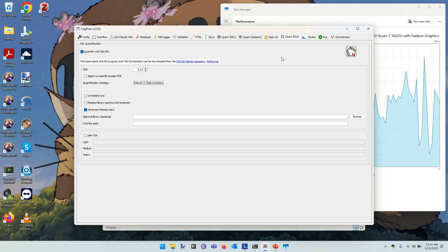Shifting to just a different way to handle cysteines creates a bit of a nightmare for adapting the software to that purpose. Yeah. I ended up doing what anybody else would, going to the online forum for FragPipe and posting an issue. And they got back within 24 hours on how to do this. Oh, yeah, that's really good. Yeah.